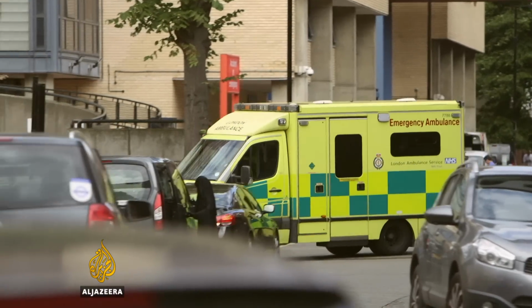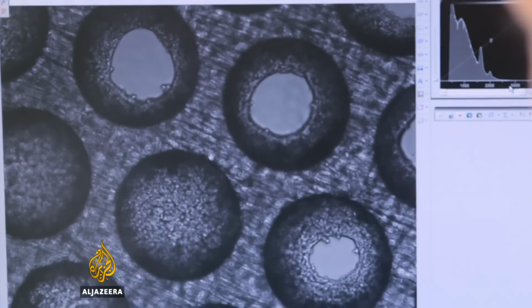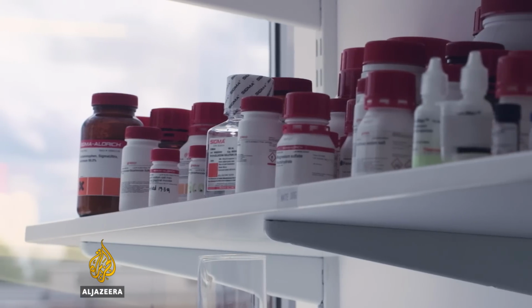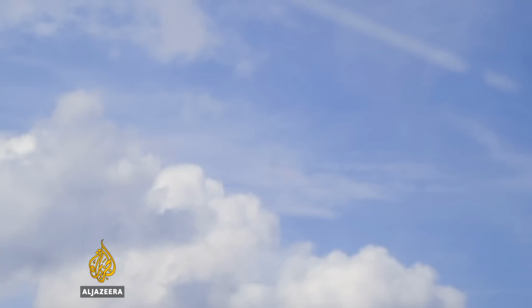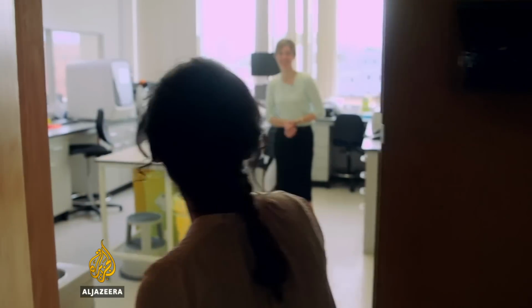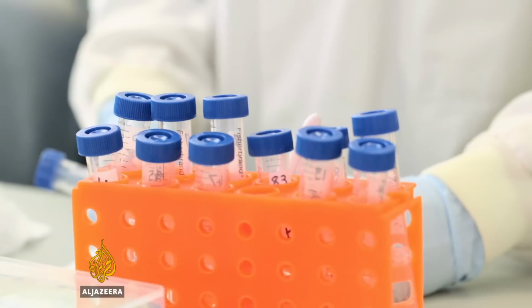Organs on chips replicate the tissue structures and biological function of human organs, and those being developed include lungs, hearts, kidneys, and livers. This then allows researchers a quicker and easier way to test new drugs for some of the biggest global diseases. Just outside London is CN Bio Innovations, an organisation who have created a human liver on a chip with the hope that new drugs can be found to help treat and cure liver diseases.